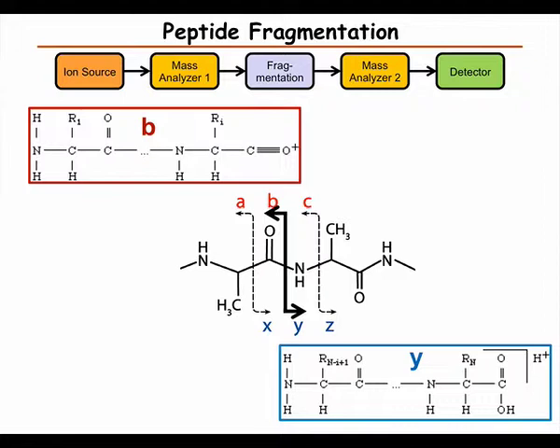And here it's the peptide bond, where the two amino acids come together when the peptide is synthesized, that breaks. And then we get these two pieces.